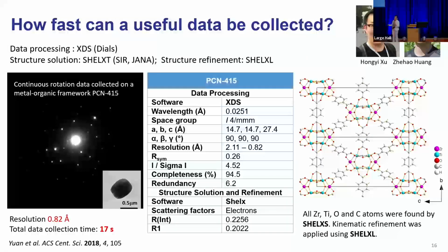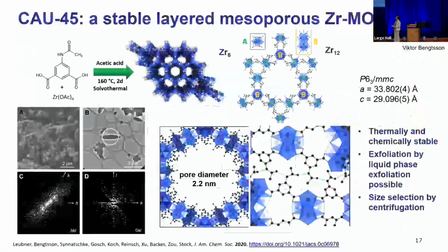And as you said, there are dynamic effects. Yes. So how will that be reflected? We generally have a higher R value than what you see for X-ray diffraction. And this high R value doesn't necessarily mean that your model is wrong. It's more related to how much dynamic effect you have in your sample. But still, the model is correct.